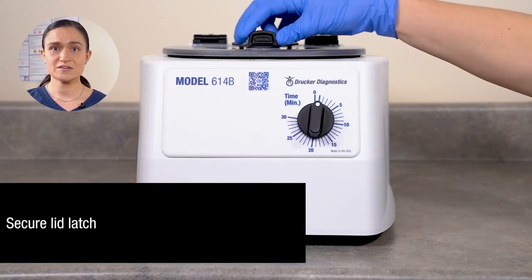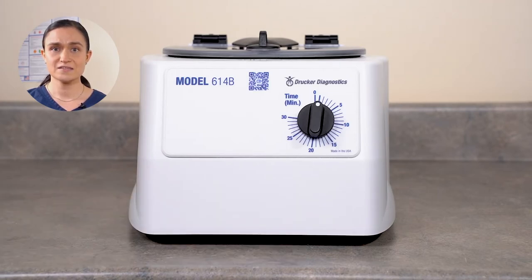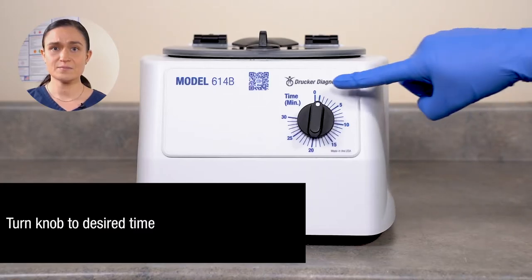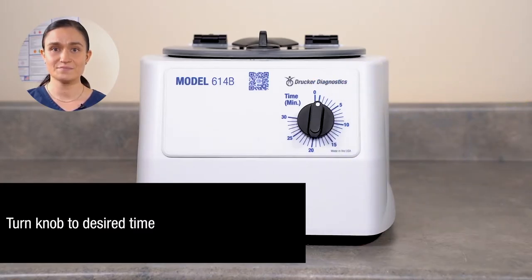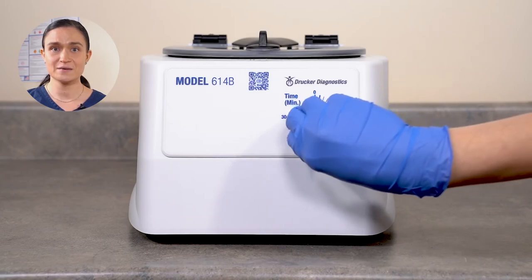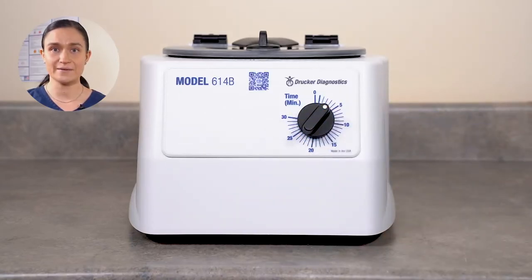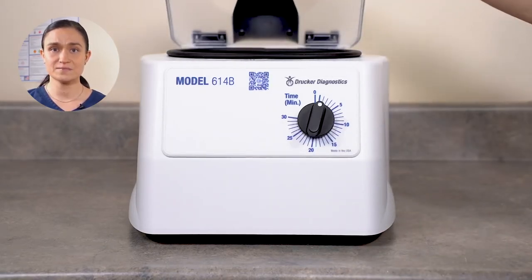Close the lid. Secure the lid latch by pressing it down gently and turning it a quarter turn counterclockwise. Next, select your time using the timer knob. The numbers around this knob indicate minutes of spin time. You may select any value from 0 to 30 minutes. In our case, we're going to run for 3 minutes, but you can run whatever time you like. Once you set the timer, the centrifuge will start automatically. The rotor will begin to accelerate and the centrifuge will run for the time selected. Once the run is complete, the centrifuge will begin to slow down, eventually reaching a complete stop. You may then open the lid and retrieve your samples.